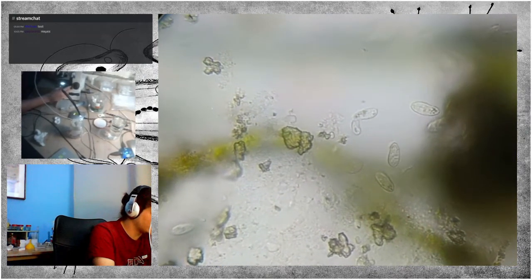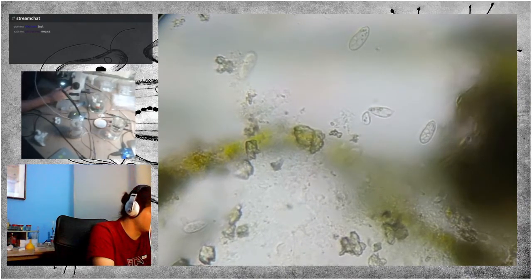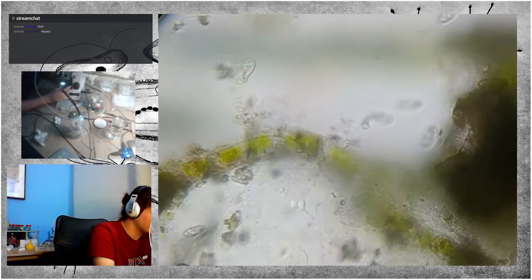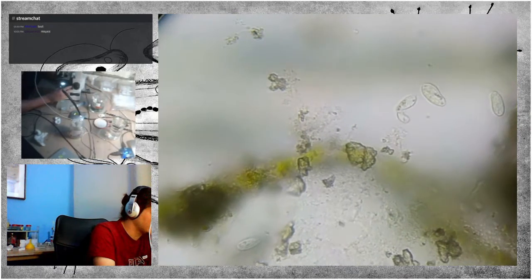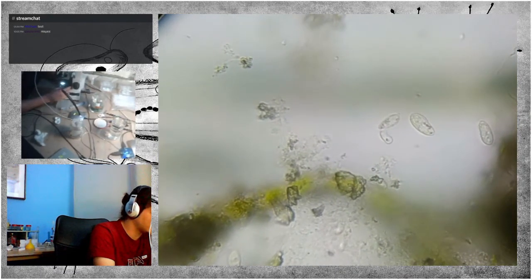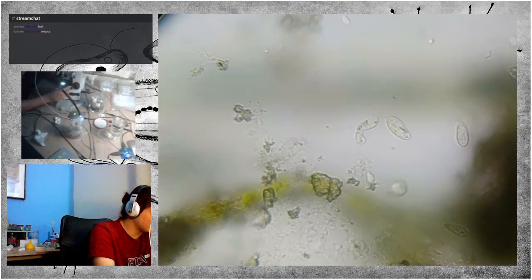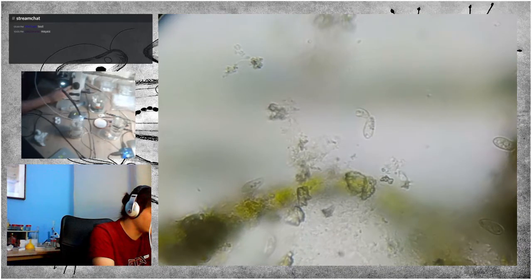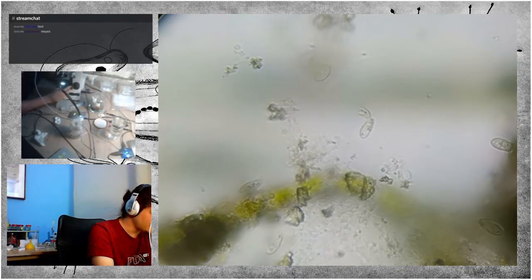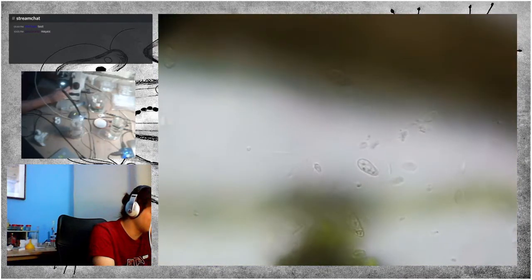The ciliates merge their cytoplasm, how's it called, with a cell membrane merging, and from that opening they exchange genetic material, so they can increase the diversity among the population, because after a certain amount of cell divisions, the cells can accumulate genetic damage by mutations that naturally occur in the genome, and the mutations can lead to various evolutionary disadvantages.